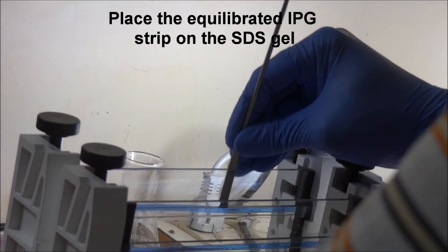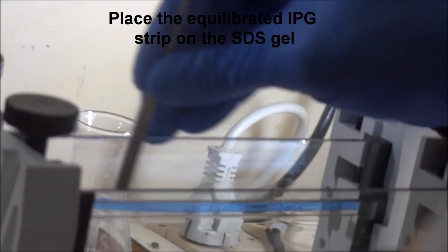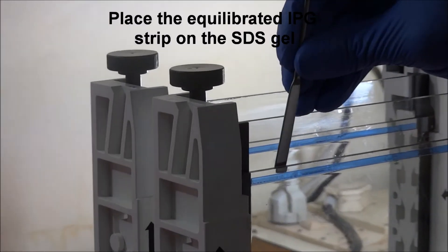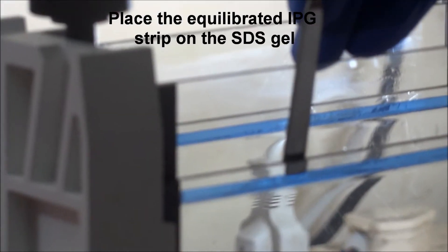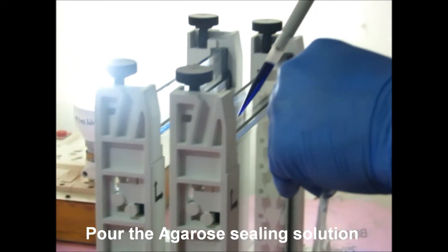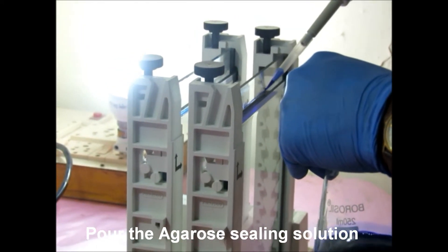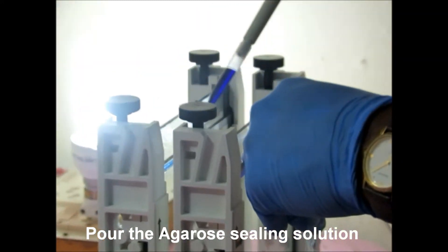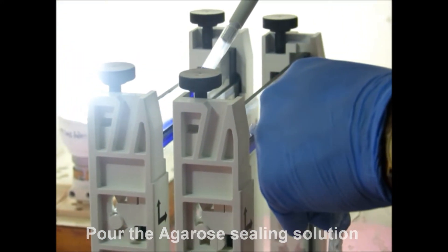After cutting, place the equilibrated IPG strip on the SDS gel gently. Pour the agarose sealing solution. Agarose sealing solution contains SDS electrophoresis buffer, agarose, and bromophenol blue.